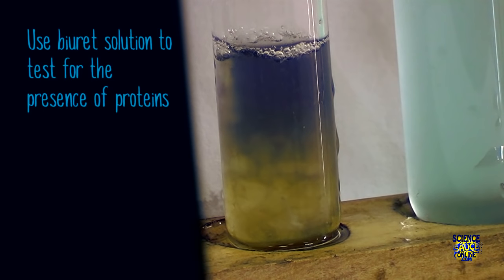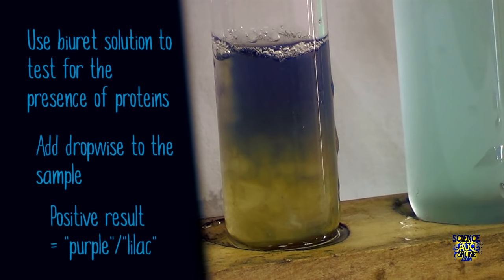So to summarize, use biuret solution to test for the presence of proteins. Add it dropwise to your samples and it'll turn purple or lilac color if protein is present.